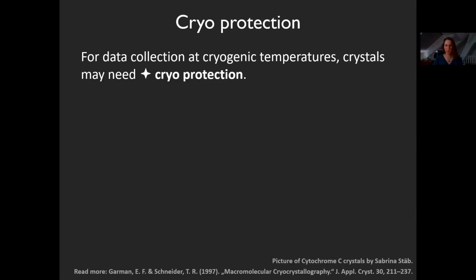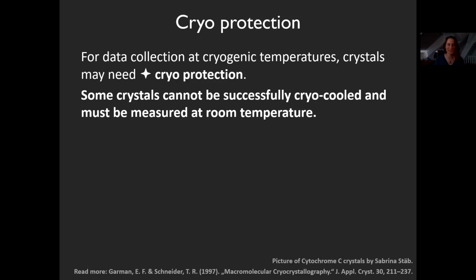It's also very wrong to say you're freezing your crystal. You're not freezing your crystals in liquid nitrogen. You're cooling your crystals. You really, really don't want them to freeze. Don't say that. Some crystals cannot be successfully cryo-cooled and must be measured at room temperature.